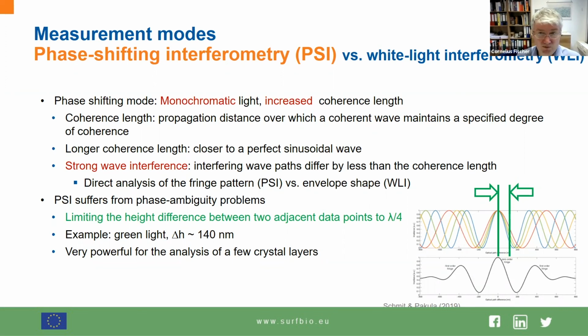the physical limitations. What you can do using phase shift interferometry is detect changes that are constrained by the two green colored lines here. You'll be able to analyze height differences in a range of about lambda divided by 4. So that's this section here. They are responsible for this kind of phase shift. Nevertheless, the precision is one order of magnitude higher than what we have seen with white light interferometry.